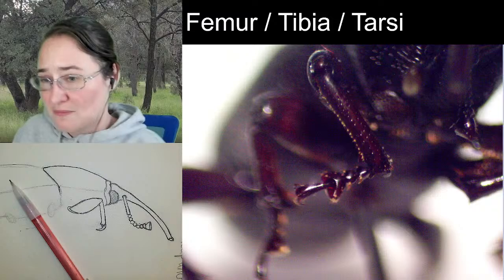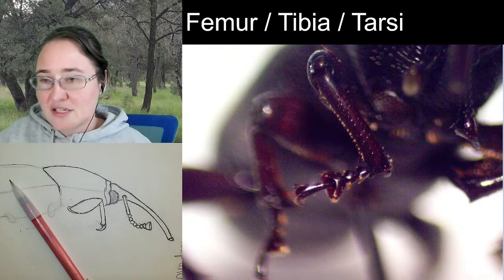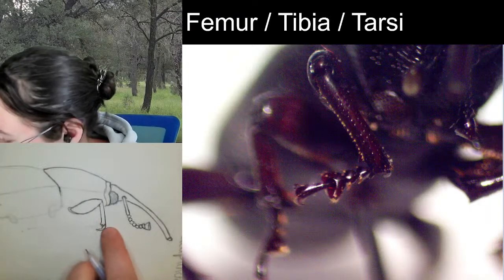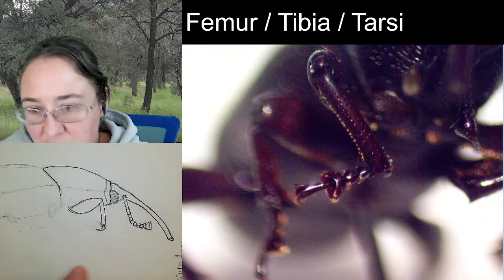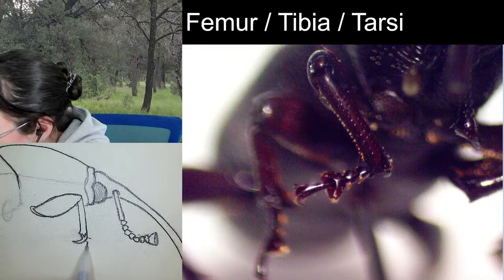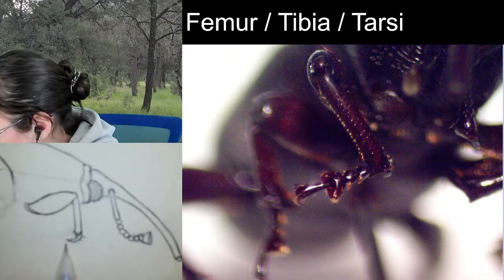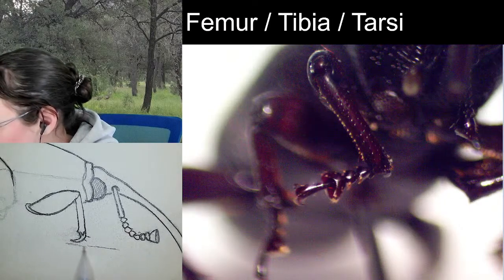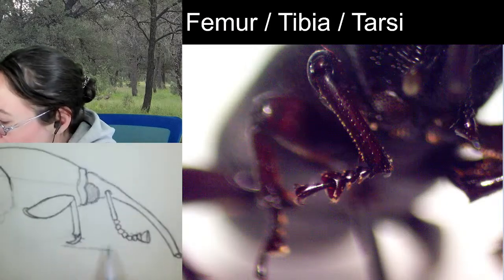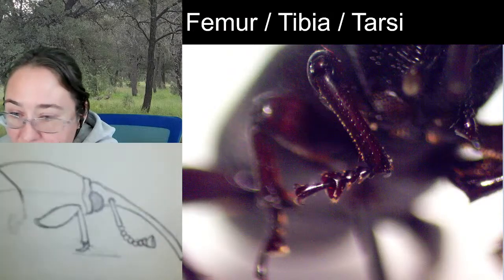And I imagine, because these are an Arizona weevil, that holding on to the substrate in the sand is probably important. So these are going backwards, but our tarsal segments are actually going to be coming forwards from way up here. This is where our tarsal segments are going to be coming out, because this spine is going backwards. And where the bottom of the spine is, that's where the bottom of our tarsal claws are going to be, because they would be lined up. So you could even imagine where you want your weevil walking, and you can put your tarsal segments right on top of that.